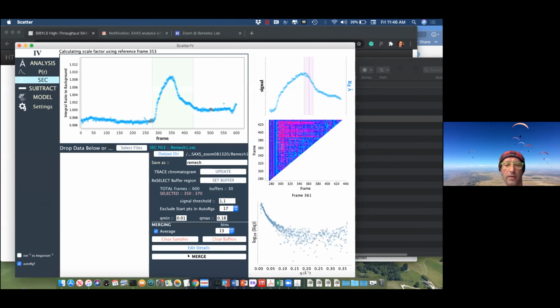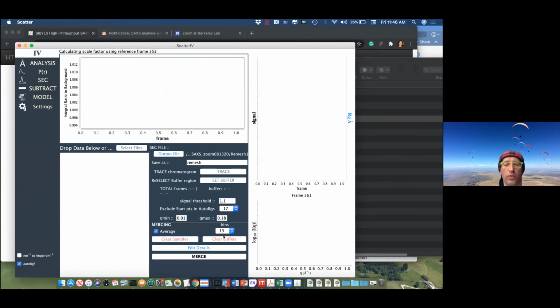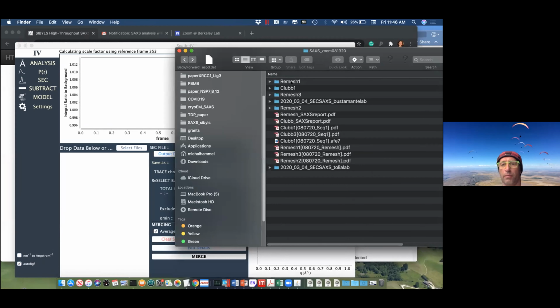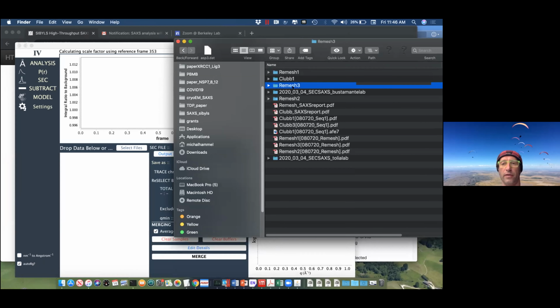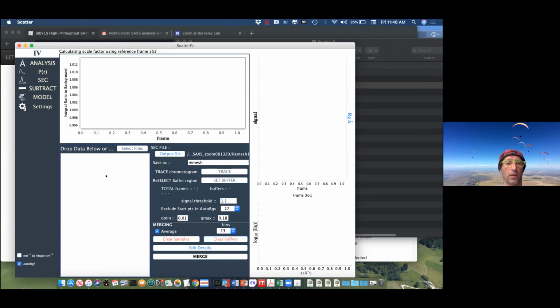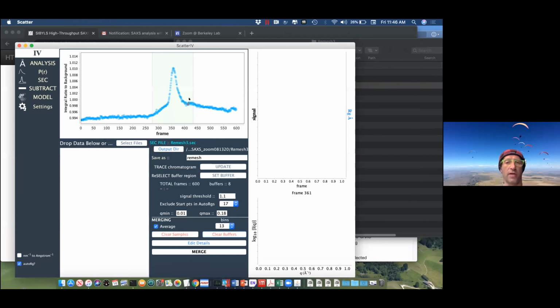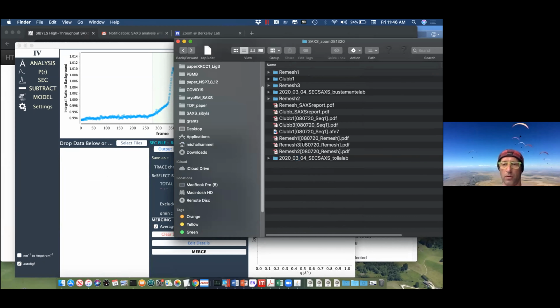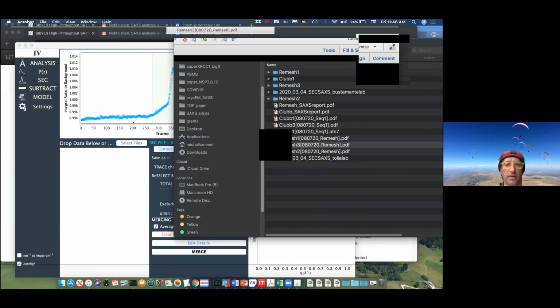But let's take a case in between, something that seems doable, but is very important for you, because the samples you send us are most likely very difficult to do with cryo-EM or crystallography. So that's why all those cases have some aggregation or some problems. So this is a sample from the same users, and you see the void is here, and the separation of the void is better in this case. So you have a peak that is well defined. We again look at the MALS and define the molecular weight, and that's this case right here.